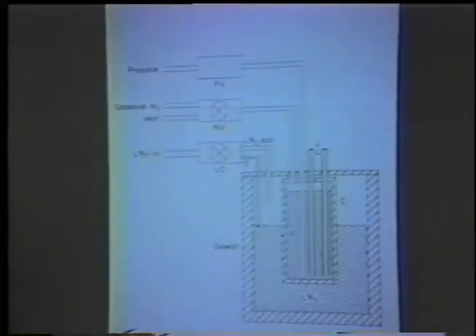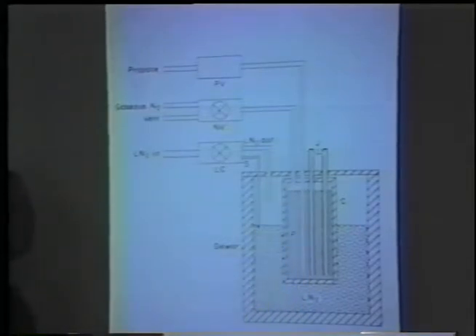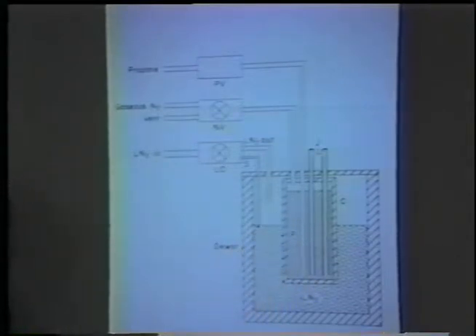Meanwhile, you're preparing your sample, which, as I said before, is the limiting factor in any of these techniques, both in the time that it takes to prepare the sample and the effort and thought that it takes to make sure the sample is healthy by the time you get it in the machine. By the time you've finished preparing the sample, the machine has generally been ready for a long time. That is, the cryogen has been cooled to operating temperature, whatever that might be. Liquid propane, I use minus 190.